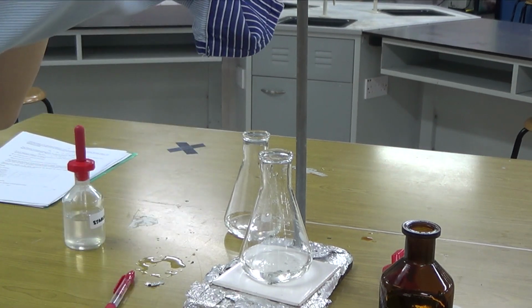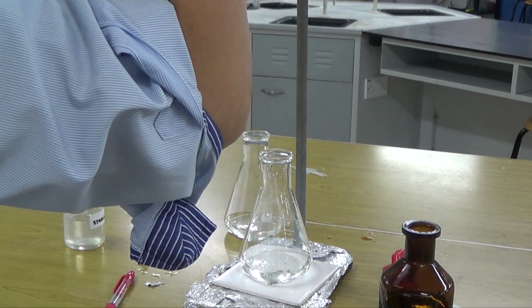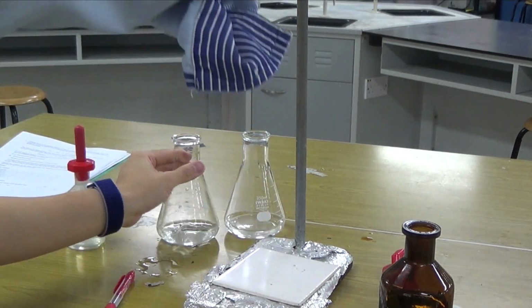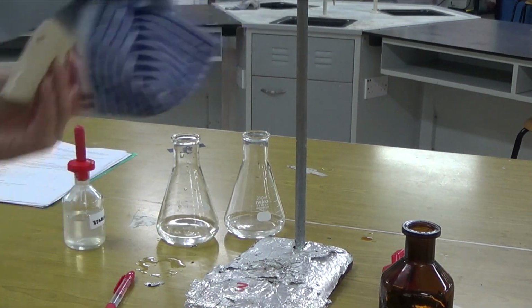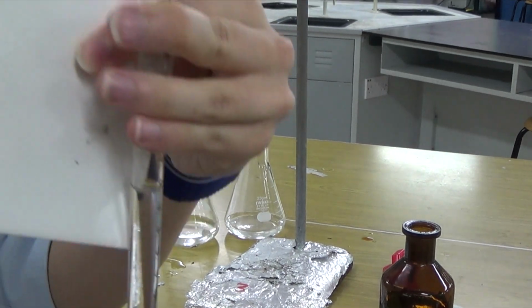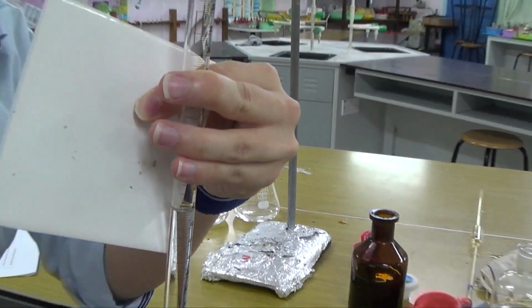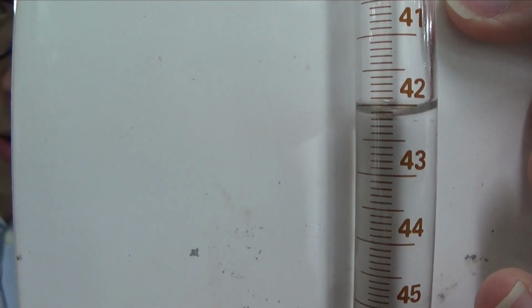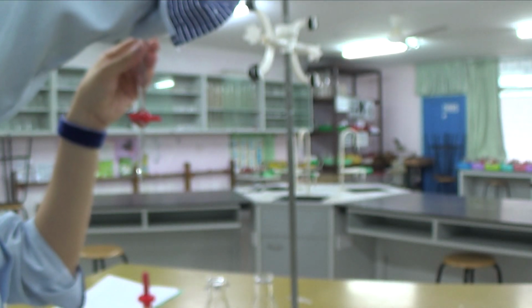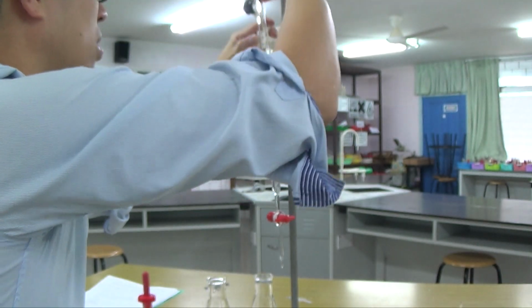41.0. So, sorry, no, not 41, 42.0, okay? Am I correct, 42.0? Give or take, actually that's 42.1 to be honest. 42.1. Oops, let me just zoom that out. I have lost a bit of accuracy, so that's 41, that's 42. So that should be 42.1. You might read it as 42.2, but I read it as 42.1 cm cube just now. So that was 42.1 cm cube.